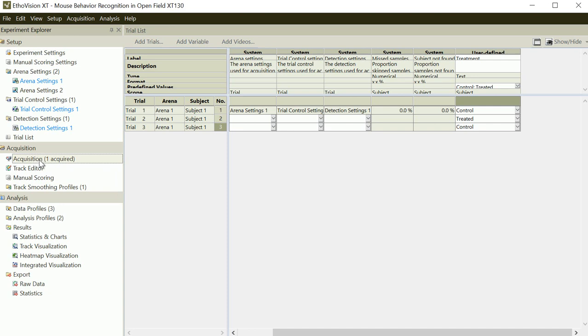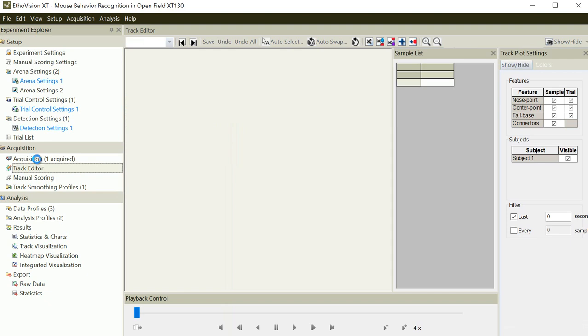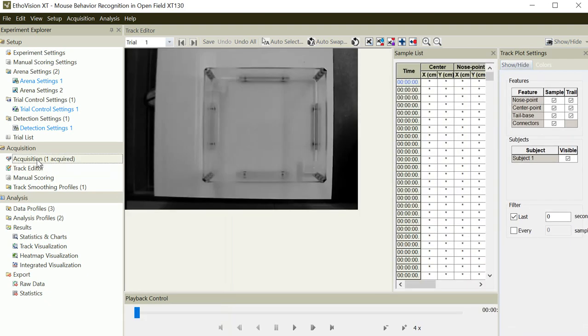So you will go to acquisition. So this is a trial version, so you cannot acquire the data. So I will show you how to acquire the data afterwards. So let me go to the next functionality. So this acquisition, you will acquire data as a routine.